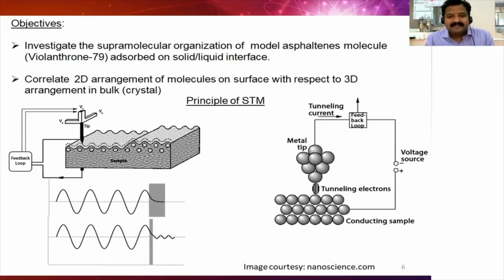And why does this tunneling take place? Because tunneling is also an example of the wave nature of electrons. When the electron hits a barrier and the barrier thickness is large, it will not penetrate or tunnel through this barrier. But when the barrier thickness is getting smaller, the electron, due to its wave nature, easily tunnels across, and this barrier thickness is in the range of a few nanometers, or even the thickness of one molecule.